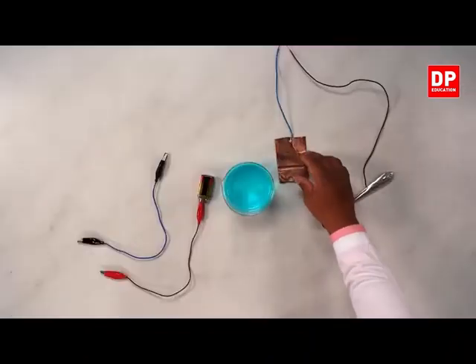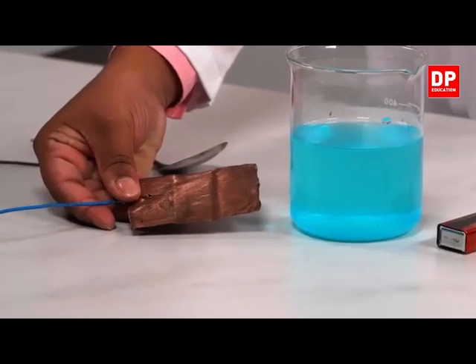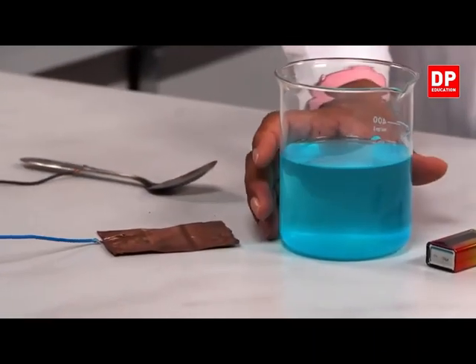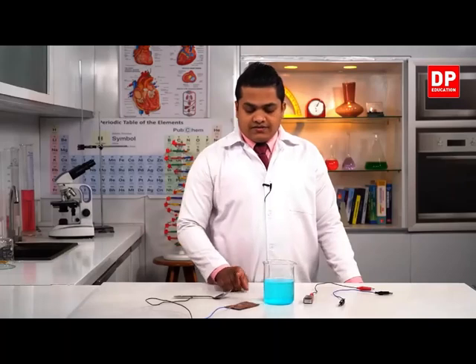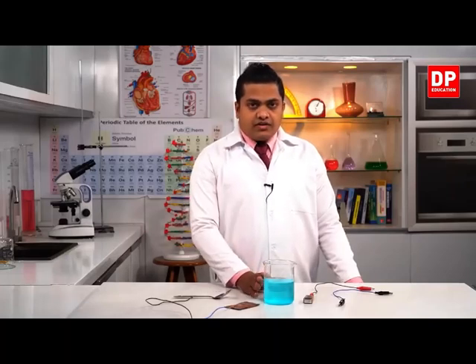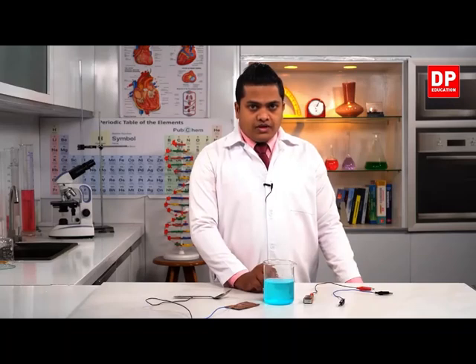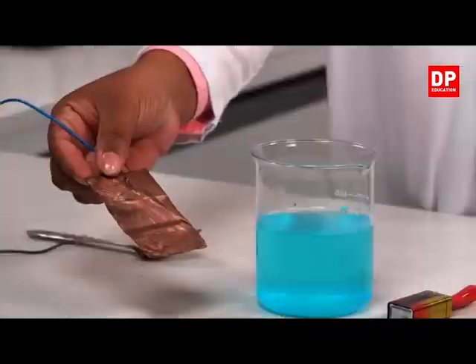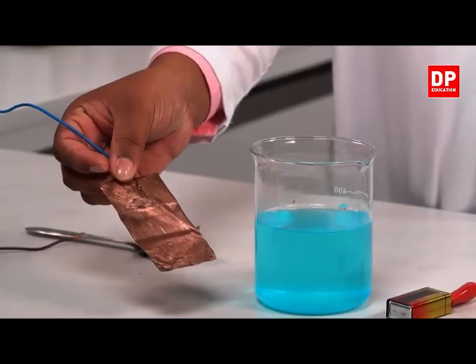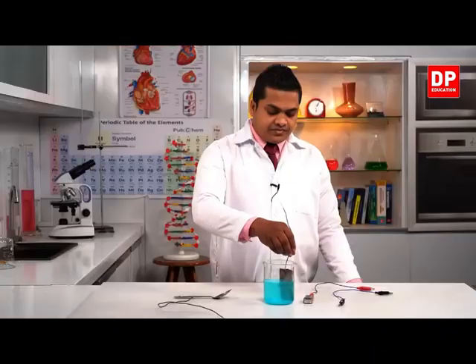First of all, I have a copper plate with me. I have scratched it using sandpaper. Then I have a copper sulfate solution. If I'm going to plate copper on a certain surface, I have to use a sulfate or a solution of copper. So this time we have used copper sulfate solution. This is my positive terminal now. As the positive terminal, I have to use this metal plate, which is copper. So I'm going to insert this into the system.